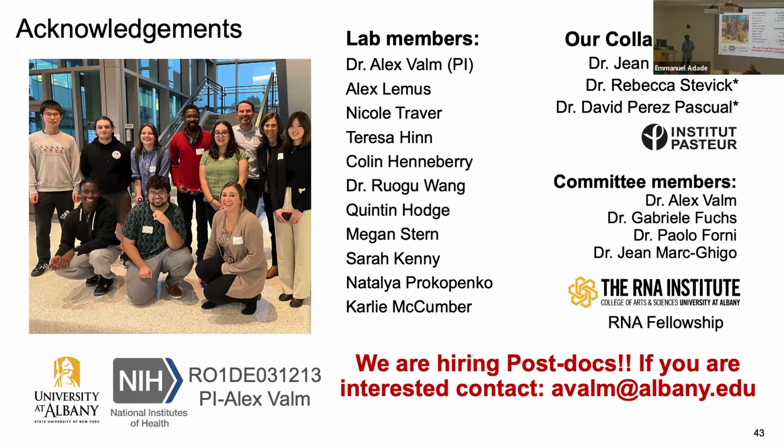And you can do the same kind of analysis statistically with a machine learning model. So you can actually have it output what are the most accurate features that are predicting these patterns, right? And that, backed with statistics, could inform the community about what we all should be thinking about when we're doing our microscopy. Thanks.